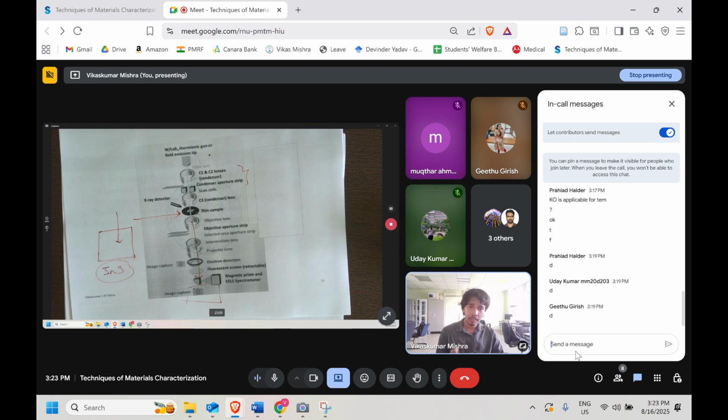So the region where more electrons are coming, the brightness of that particular region will be higher because more excitation will happen. This is the fluorescent screen working principle. If in a certain region there is no electron or very few electrons, the excitation will be less, and a smaller number of photons will be generated in return. So our eye will see that region as comparatively darker with respect to the region which is bright.